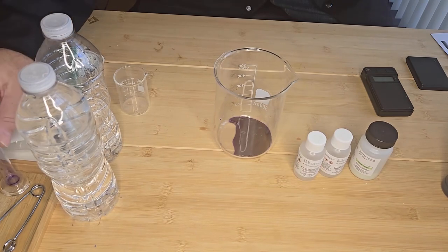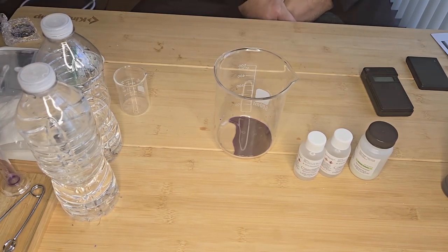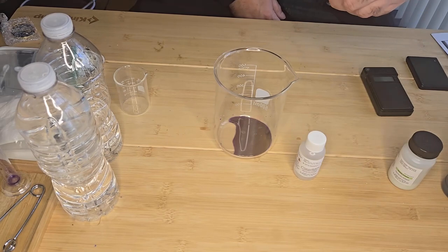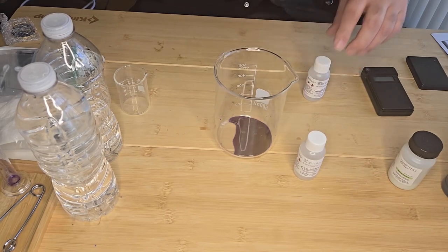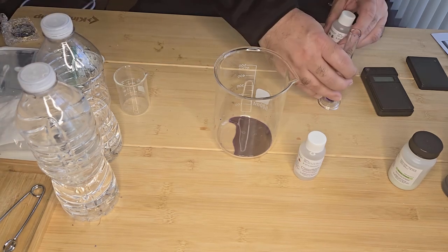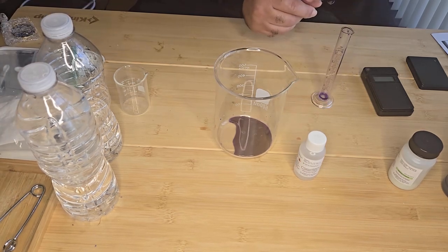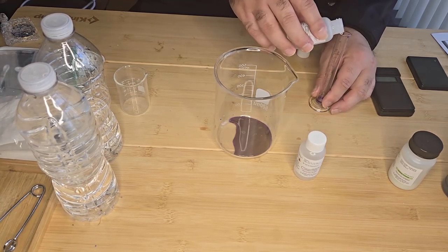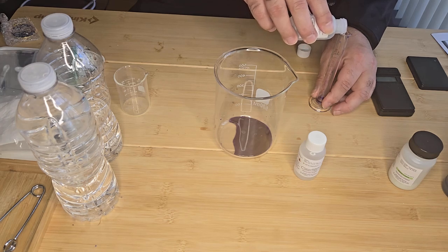Put that aside. And then I'm going to add 10 ml of 3 molar sulfuric acid. Okay, so I need my measuring cylinder again.